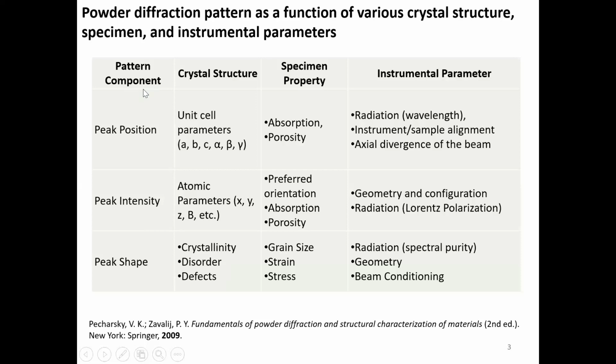Okay, so actually what we see from one powder XRD pattern, these 3: peak position, peak intensity and peak shape, we are blind to that. We don't know what the unit cell parameters or the atomic parameters are. So to get into that, we need to refine the structure.